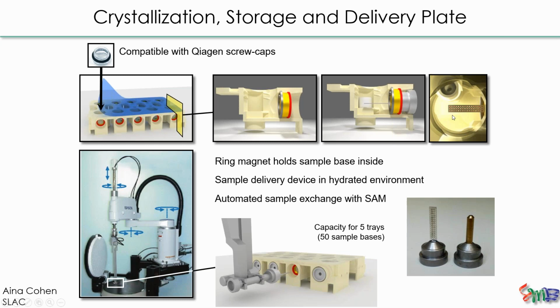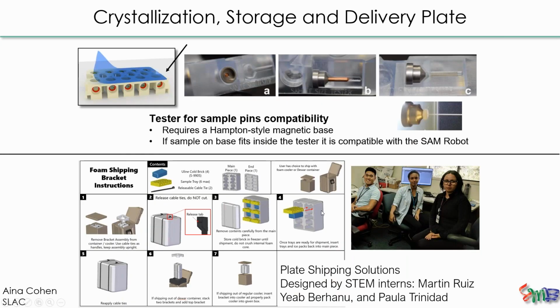You can then image these wells and know exactly where your crystals have grown, mount them directly onto the beamline and collect data on these. And there's a variety of different compatibilities. What's really cool about this is that we can actually ship these things across the country.